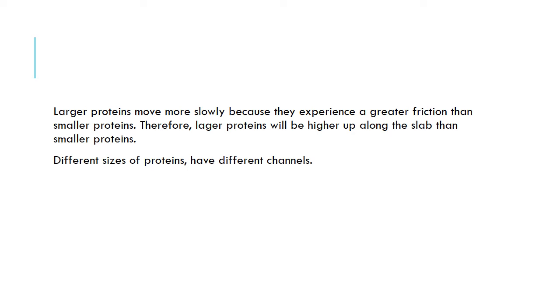So if at this point we are able to remember one of the factors that will affect the movement of the protein, we mentioned the charge. So now this one will be highly charged compared to this one.